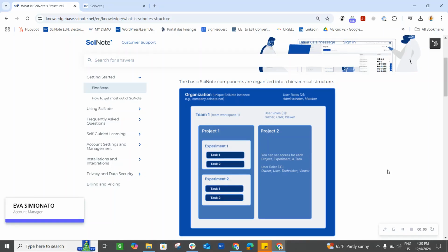In this video, I will show you how data is organized in SciNote. SciNote has 5 organization levels. All the members of your SciNote Premium site will belong to one organization. So we refer to the organization as your unique premium site.